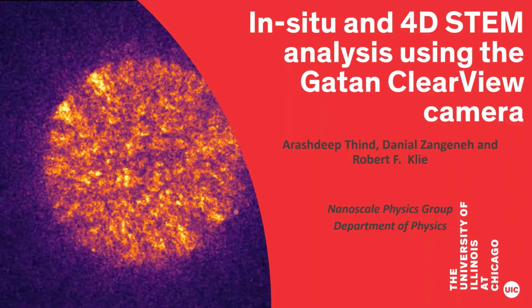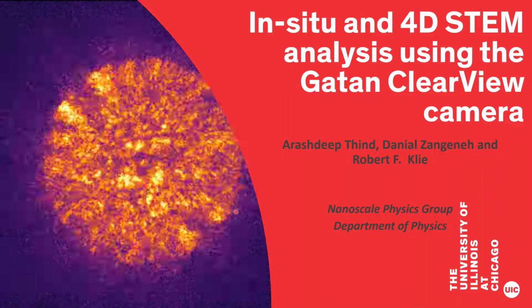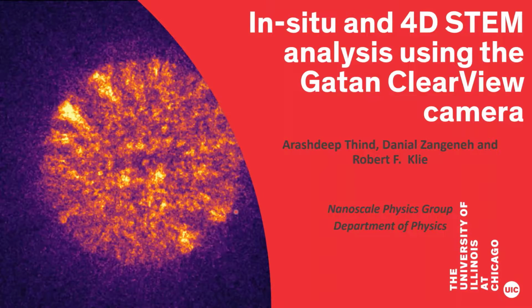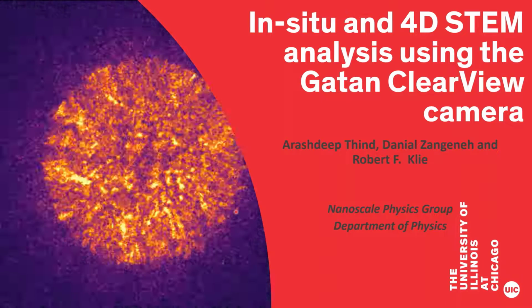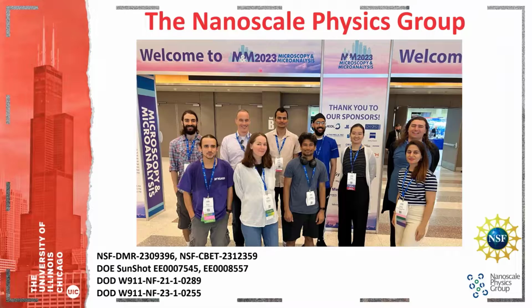We have been testing the camera for the last couple of months, and we're trying to give you an overview of the results that we have achieved with this camera, ranging from 4D STEM analysis of thin film materials to in situ videography of phase transformations of battery cathodes, as well as the dissolution and corrosion of particles in graphene liquid cells.